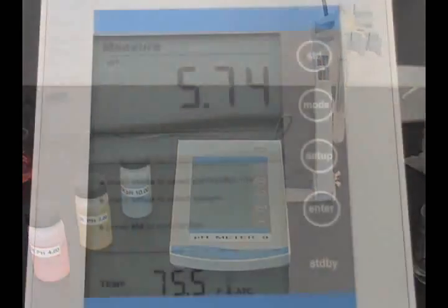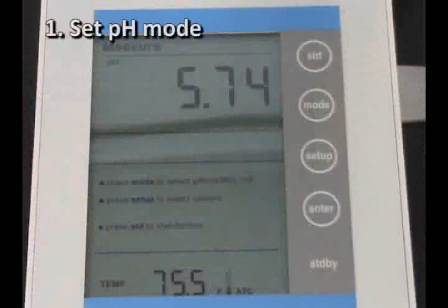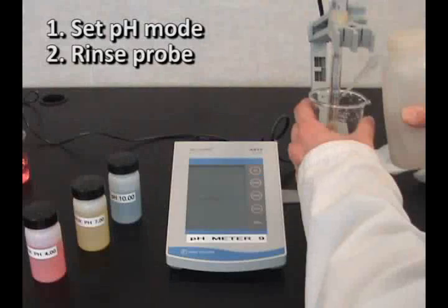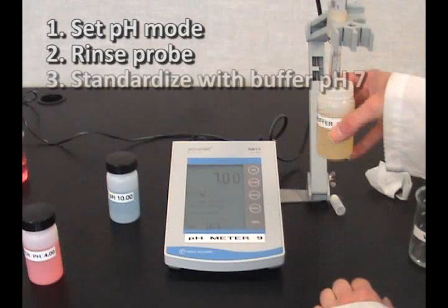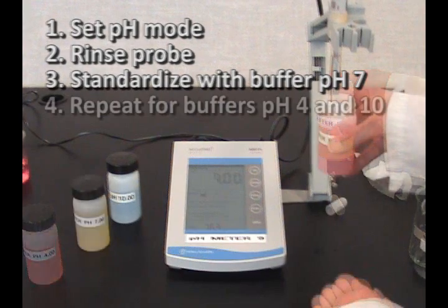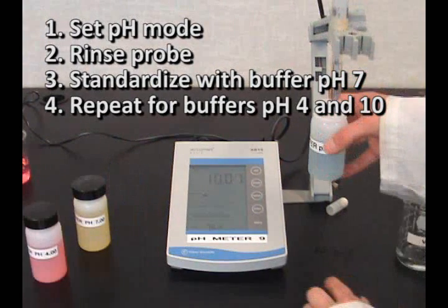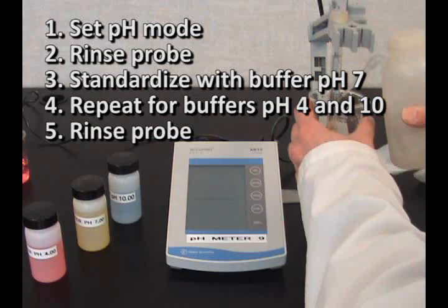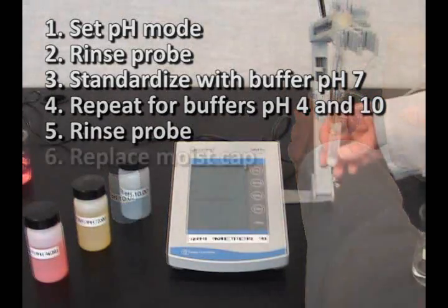Let's review the steps. Set to pH mode. Rinse probe. Standardize buffer 7 while swirling. Repeat for buffers 4 and 10. Rinse probe. Replace moist cap.